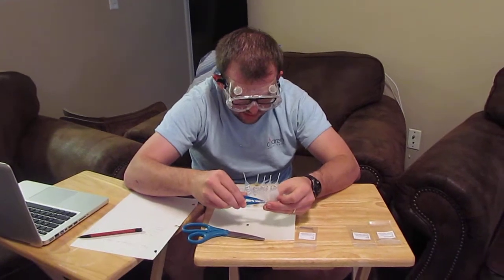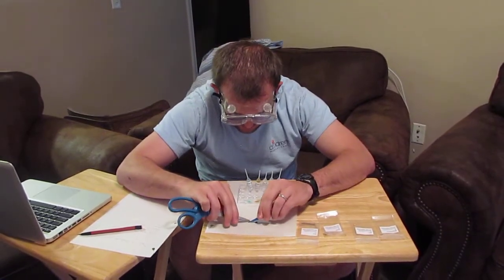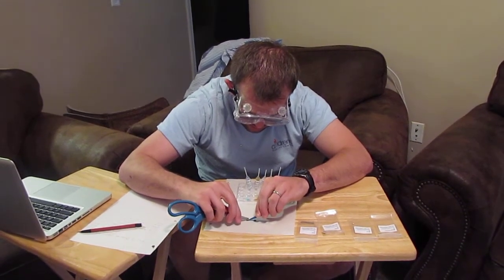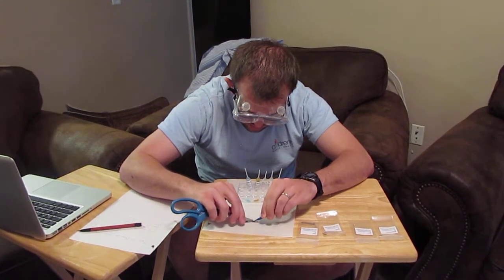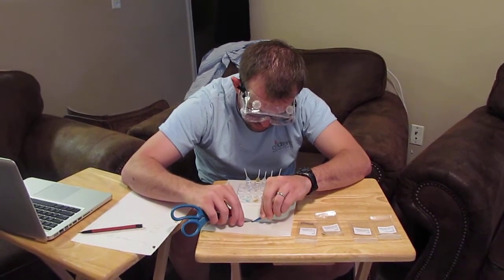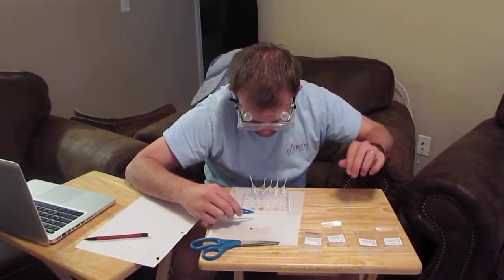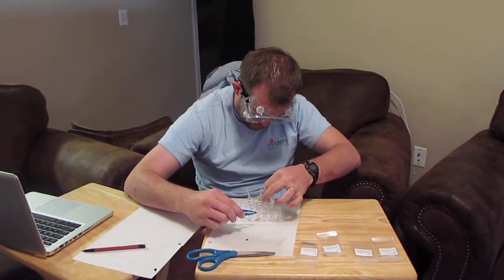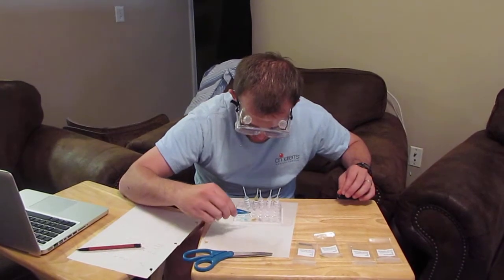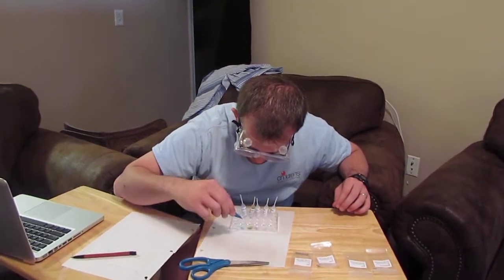Actually, I'm going to pull 2 pieces of lead out for A3 and A4. And these as well, I'm going to scrape the tops to get a more pure reaction. Alright. The first piece of lead is going into zinc nitrate in A3. My second piece will go into my iron chloride. And there we go.